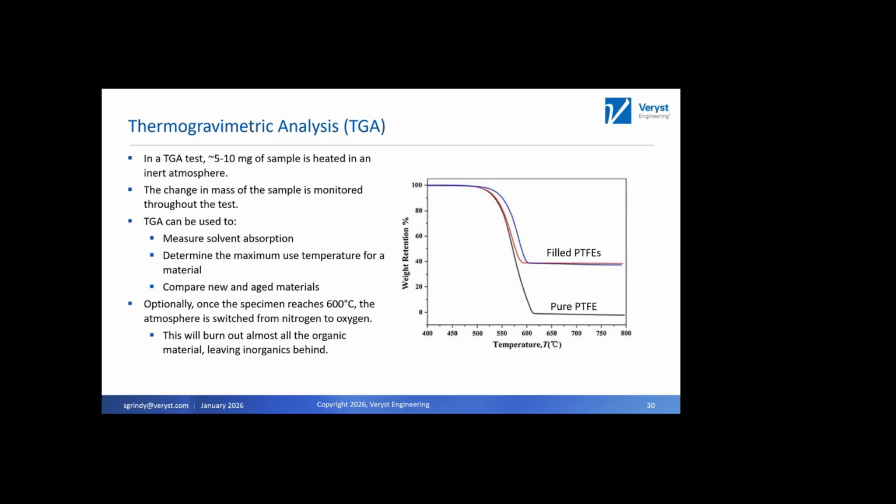What about TTS? We'll go back to that at the end. So slide 27: Tg is always before a crystallization peak. If the material has already crystallized, then no. So you will only see that crystallization peak in something like a clear PET where the crystallization has been suppressed.